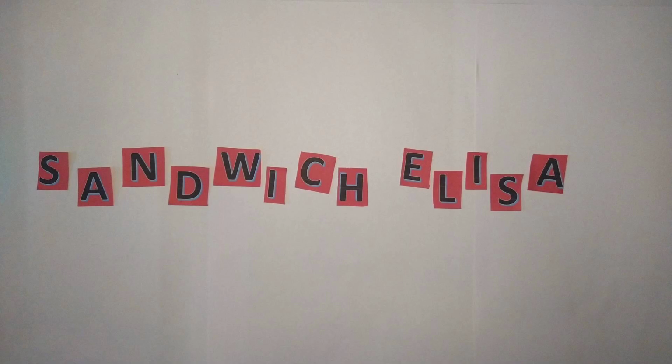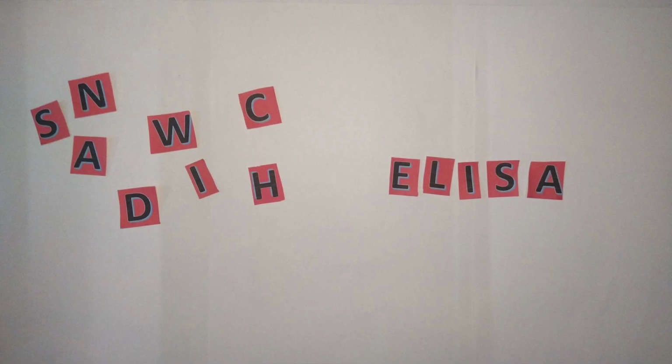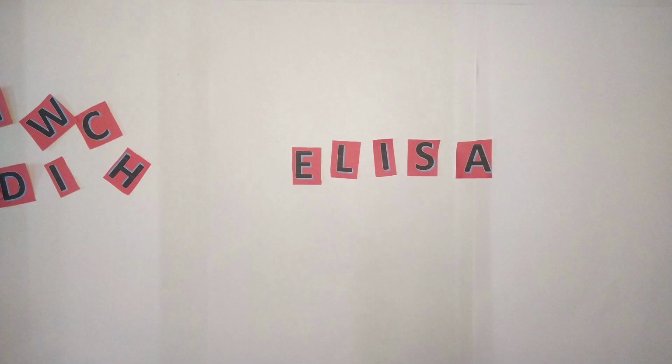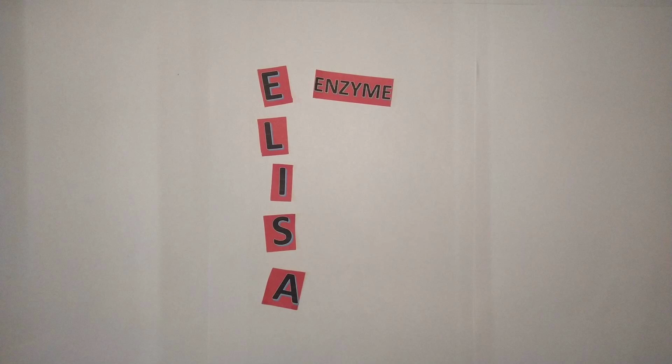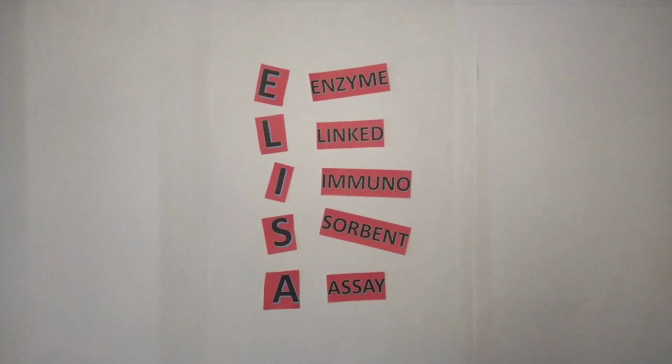Sandwich ELISA. Before jumping directly into Sandwich ELISA, let's see what ELISA means. ELISA stands for Enzyme Linked Immunosorbent Assay.